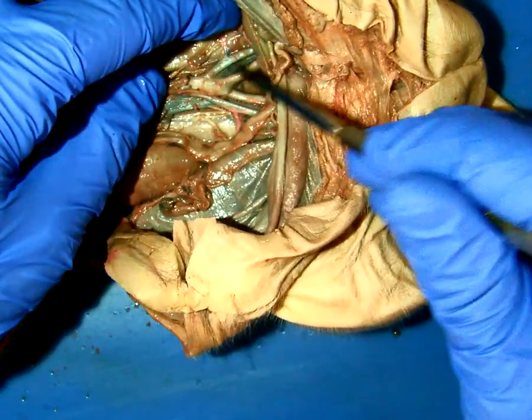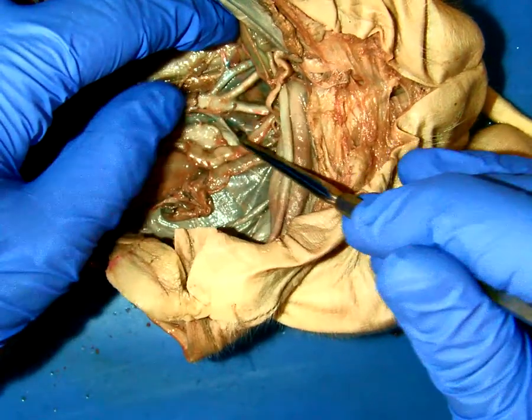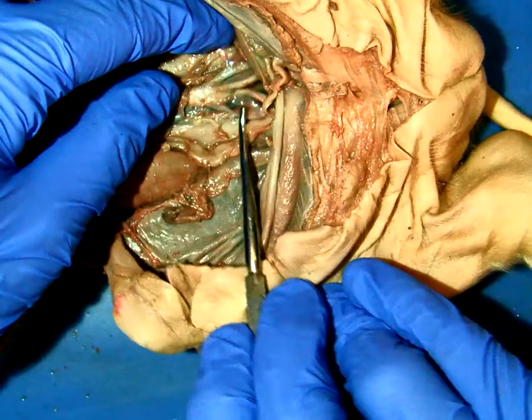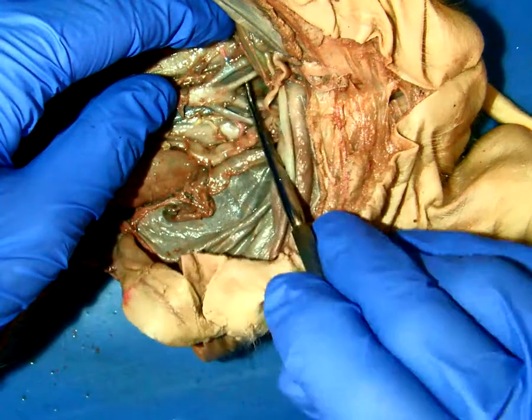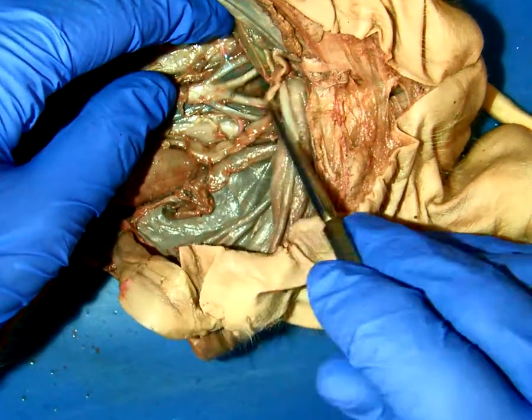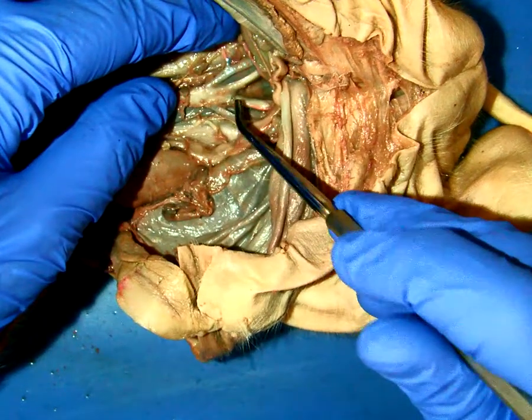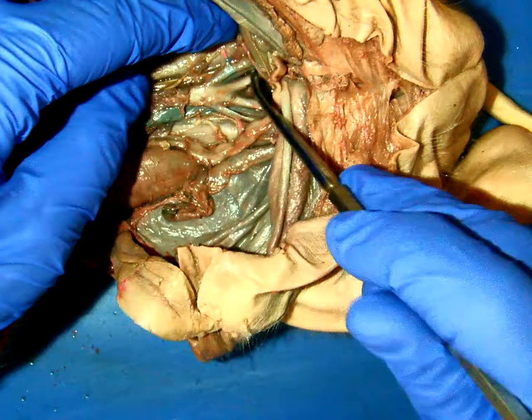So there's an iliac vein, and from what I understand, the iliac veins, there's a right one, okay, right there, and there's a left one back behind here. They will go down a little bit further and then divide. So these would be technically the common, I believe, common right iliac vein, common left iliac vein.